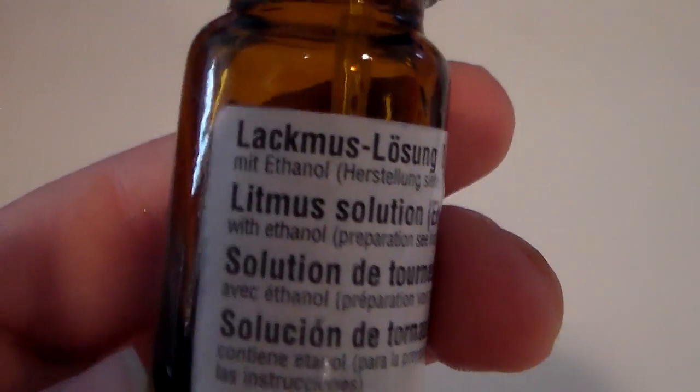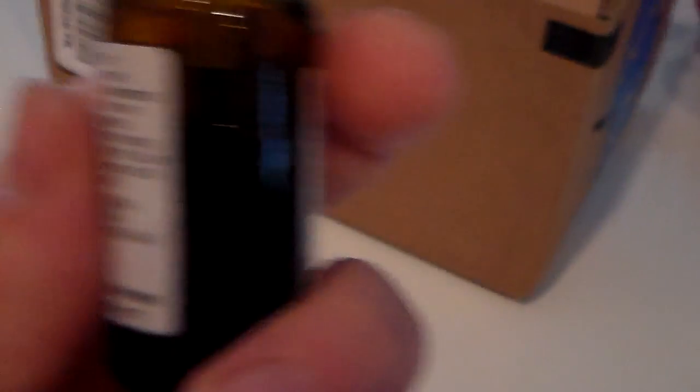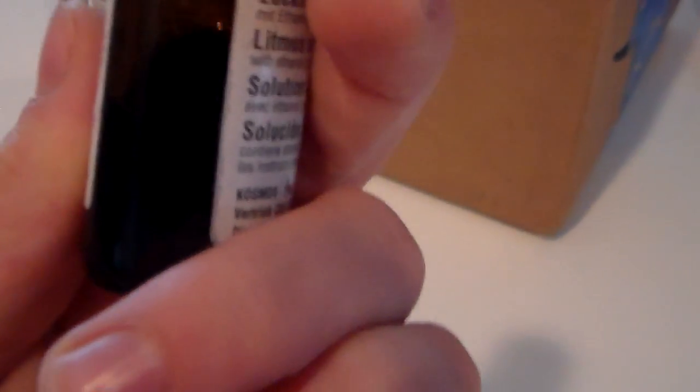Okay, after all that waiting, I've finally finished preparing the litmus solution. I have a label right here on this bottle that says litmus solution, so I never get it mixed up with anything.